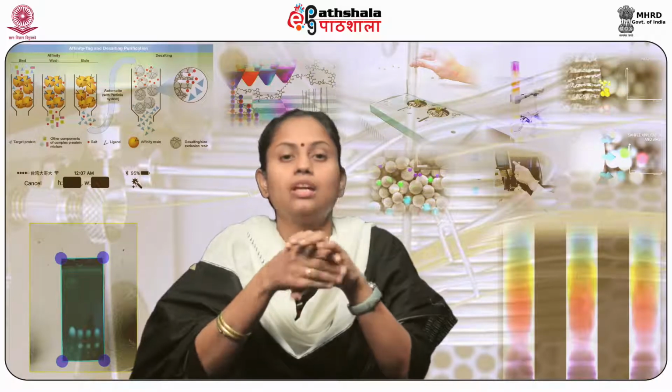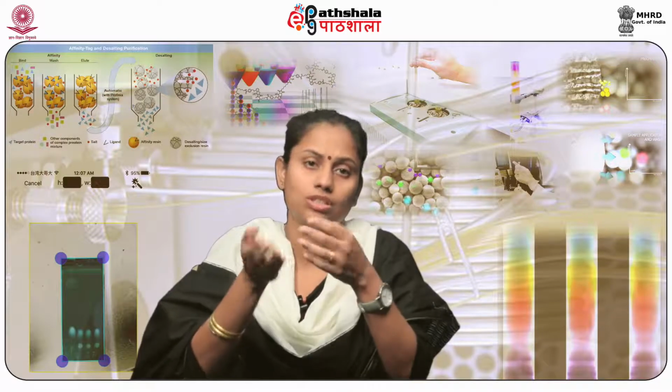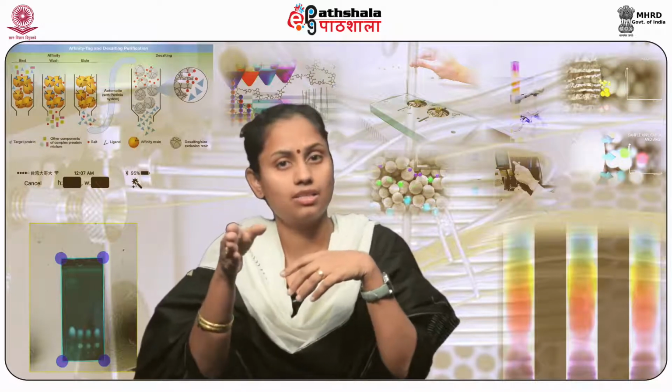In this technique, the stationary phase is usually a resin. Molecules possessing the opposite charge as the resin will bind very tightly to the resin, whereas molecules having the same charge as the resin will flow through the column and elute out first.